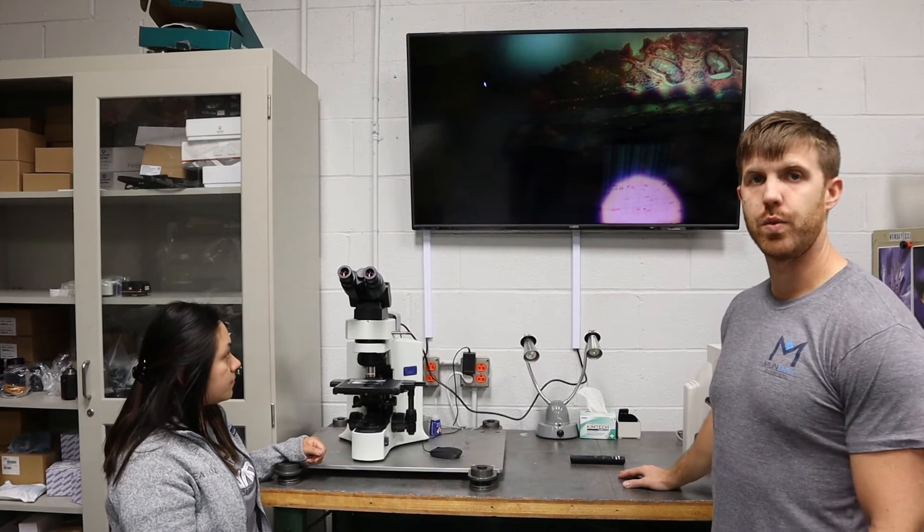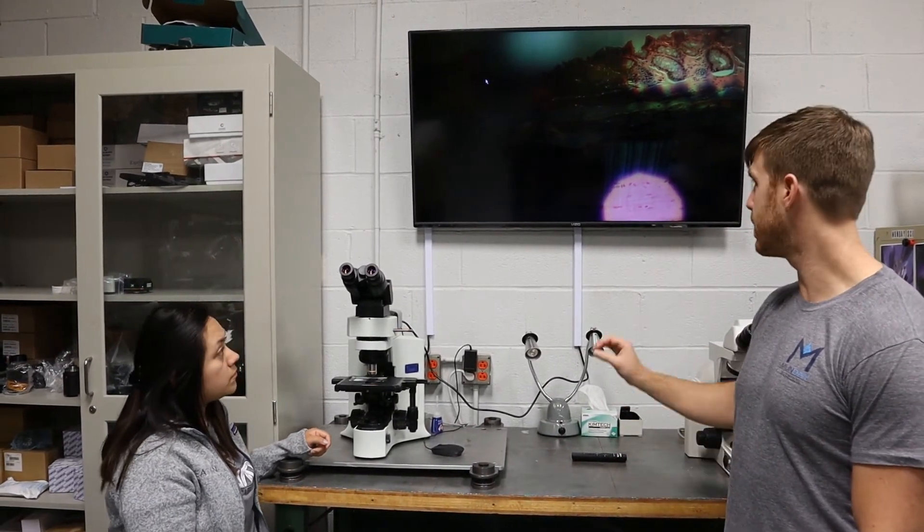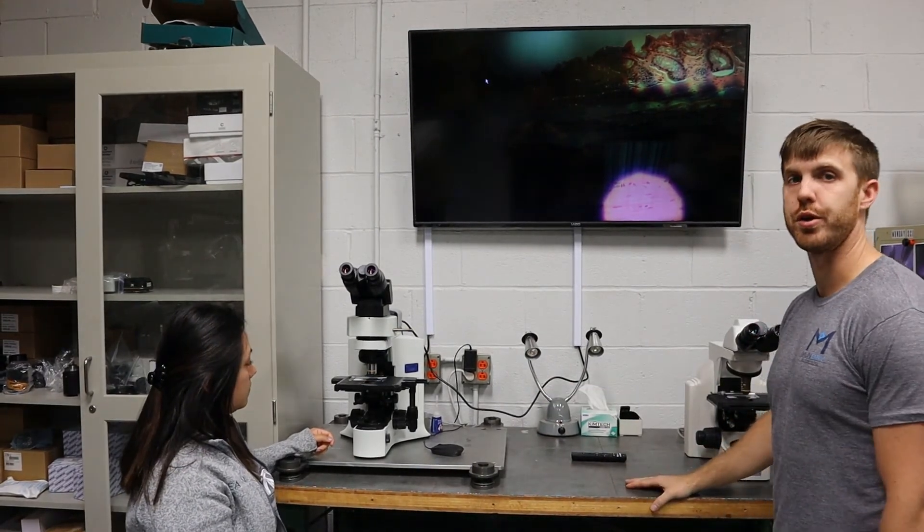So now that the condenser is at the right height, Maria is going to show you what it looks like to get the condenser image centered in the middle of the field using the two centering keys we showed you earlier.